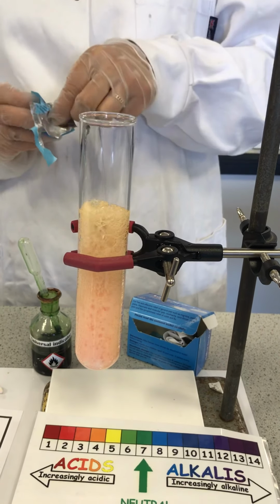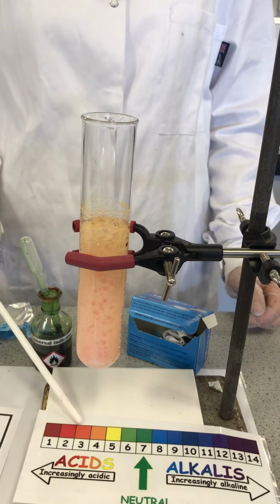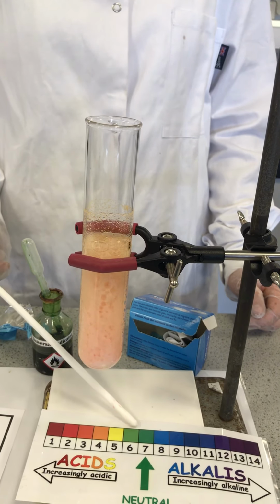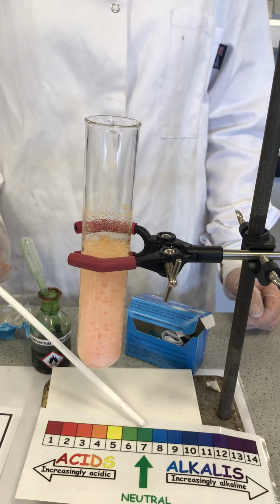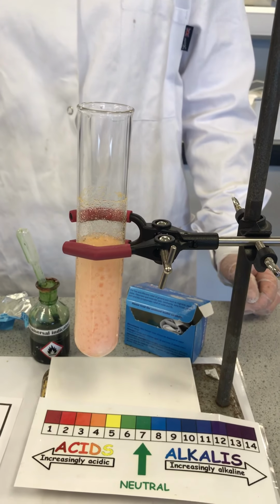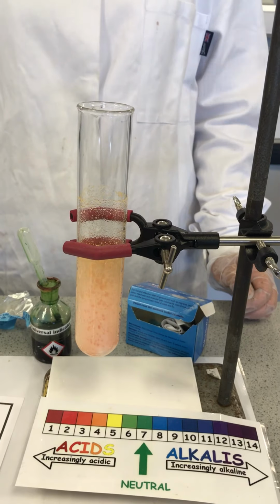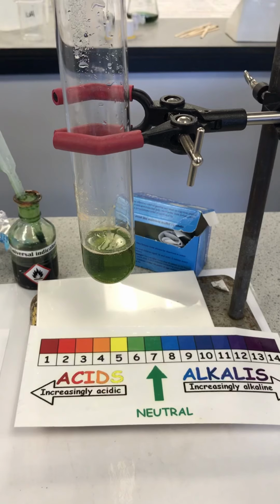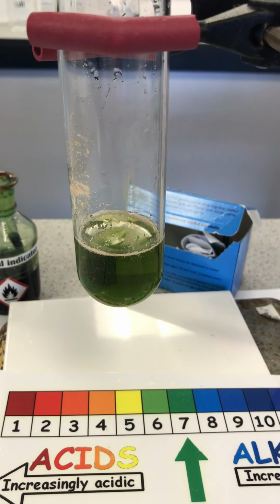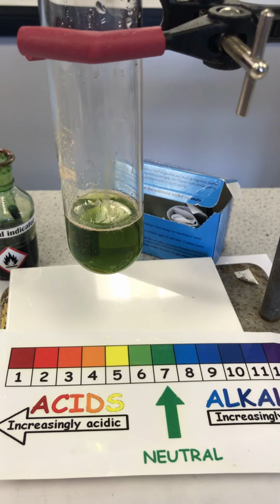As you can see, the bright red color has gone lighter, moving downwards toward pH 3, 4, and then eventually 5, and it will lead to pH 7, when we will say that the antacid has neutralized the hydrochloric acid, or the stomach acid. As you can see now, the antacid has neutralized the hydrochloric acid, which is the stomach acid, to neutral, which is roughly pH 7.